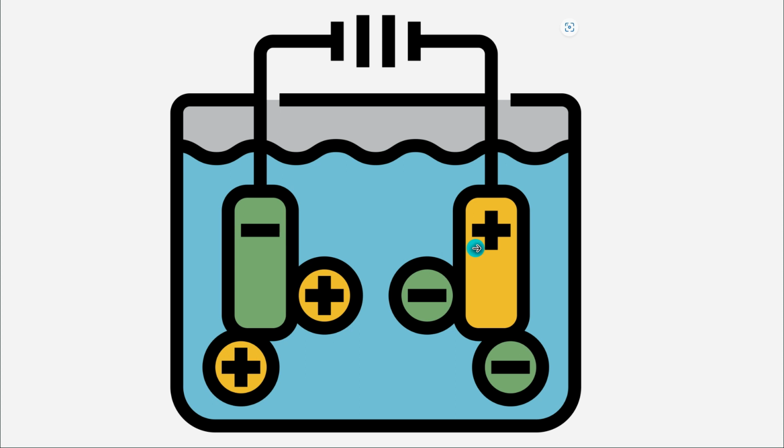and this electrophoretic technique is carried out in a specific instrument, and each instrument has its own application in order to carry out electrophoresis. It is carried out in buffer solution which maintains the electric conductivity constantly.